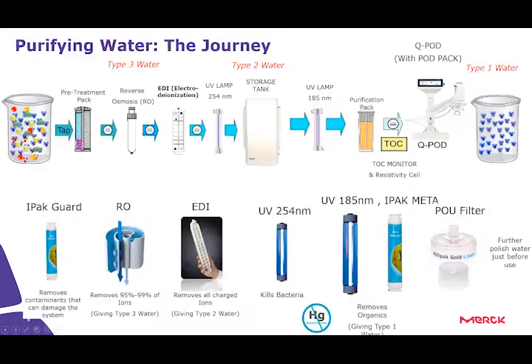It's also important to have an idea of the journey in which we are purifying the water through different stages of purification. Starting from the pre-treatment pack, which removes the contaminants that can damage the system like chlorine, silica, and large particles.